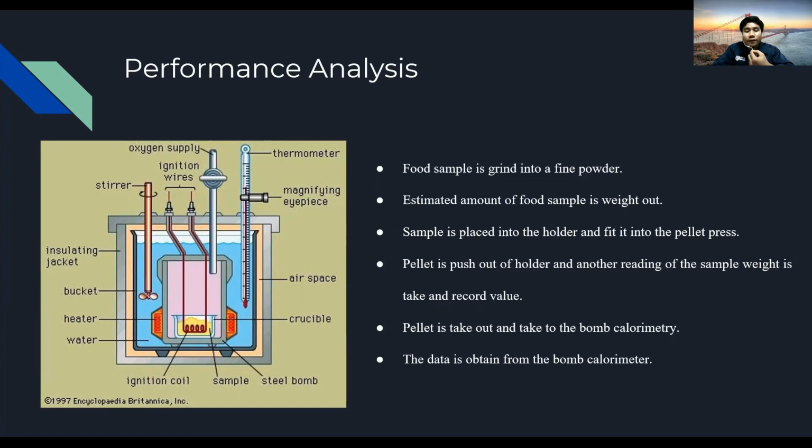And as we know, there are four essential parts required in any bomb calorimeter. The first one is a bomb or vessel in which the combustible charge can be burned. The second one is a bucket or container for holding the bomb in a measured quantity of water together with a stirring mechanism. The third one is an insulated jacket to protect the bucket from transient thermal stresses during the combustion process. And lastly, a thermometer or other sensor for measuring temperature changes within the bucket.